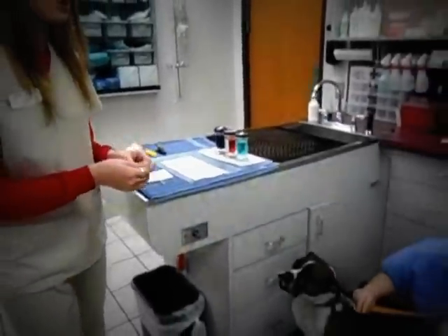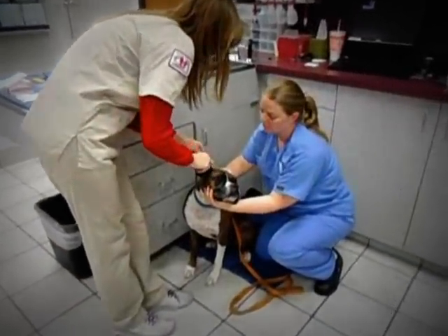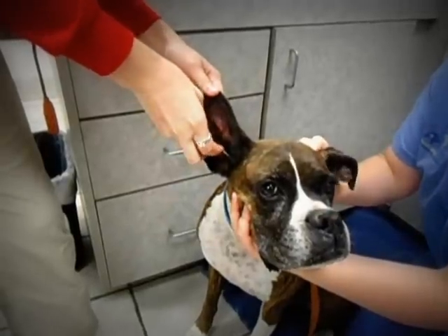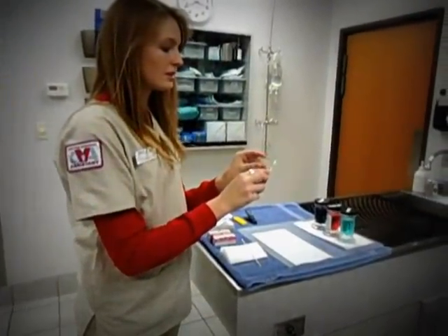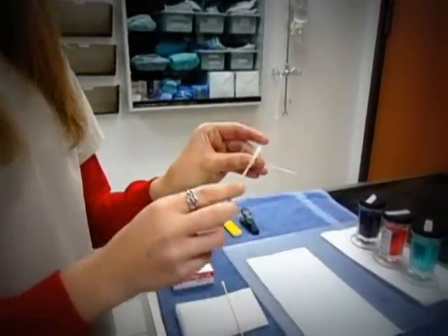When starting an ear cytology, I take my first swab and swab along the inner walls of the ear. I now take my swab and roll it onto the slide, placing the right ear closest to the right.